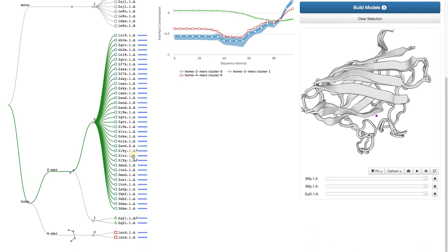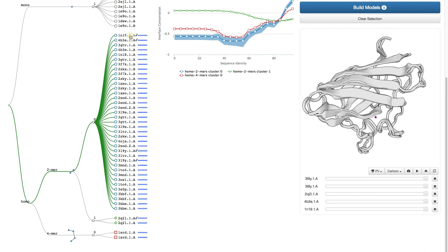You see here the two templates that we selected. From this Quaternary Structure Score, we might also want to build a model of the top two.